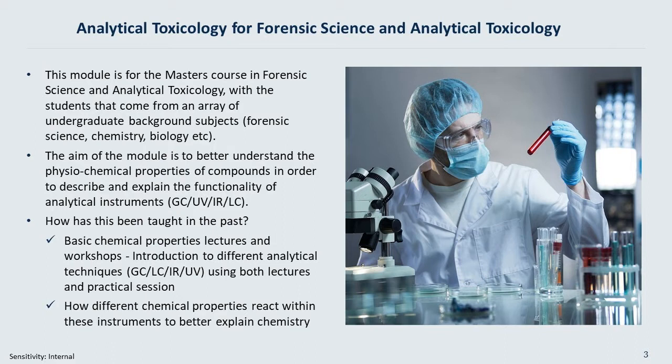So really the module is to better understand the physiochemical properties of chemicals, but also to describe the functionality of these compounds when we're looking to analyze them by analytical instruments. So the 4 techniques that we're talking about predominantly are gas chromatography, ultraviolet spectroscopy, infrared spectroscopy, and liquid chromatography.